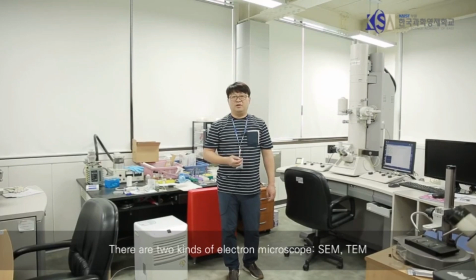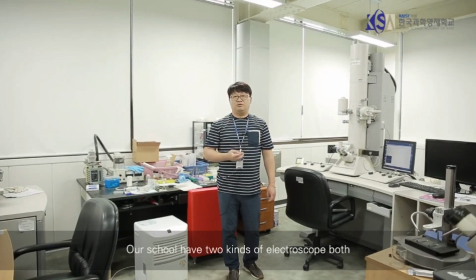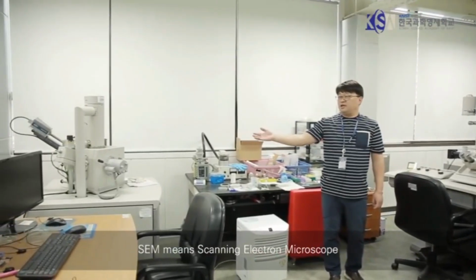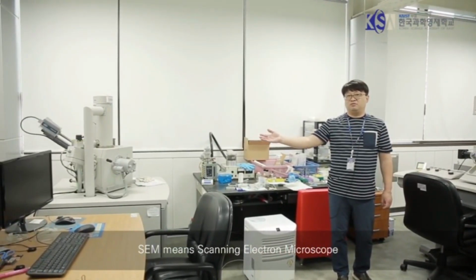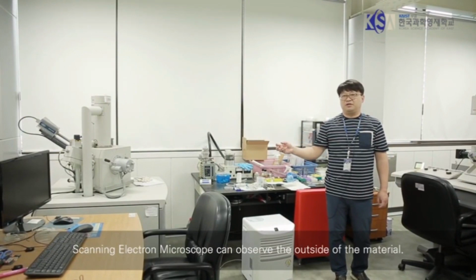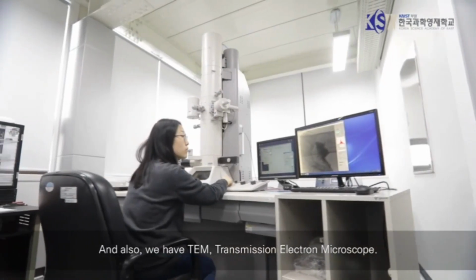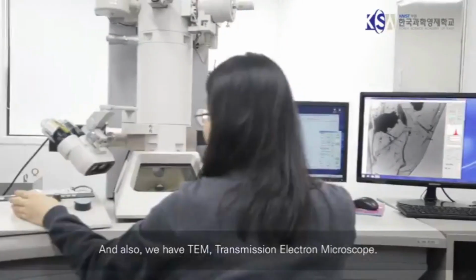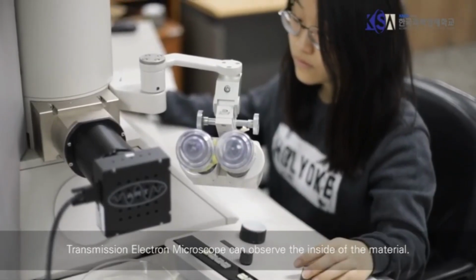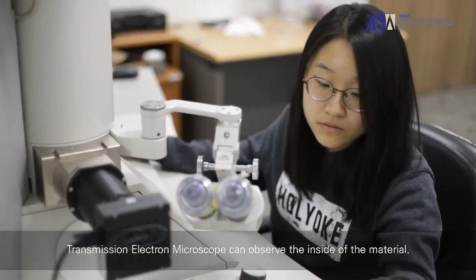There are two kinds of electron microscope, SEM and TEM. Our school has both. This is the SEM. SEM means scanning electron microscope. A scanning electron microscope can observe the outside of a material. And also we have a TEM, transmission electron microscope. A transmission electron microscope can observe the inside of a material.